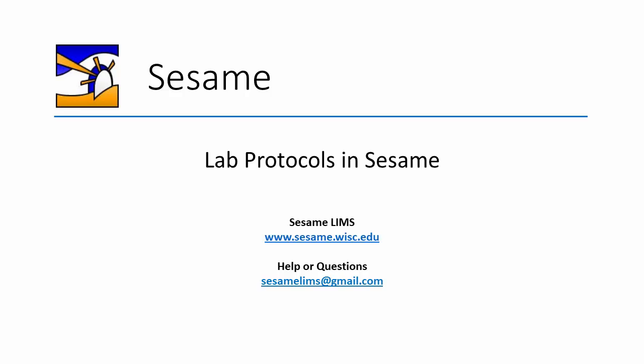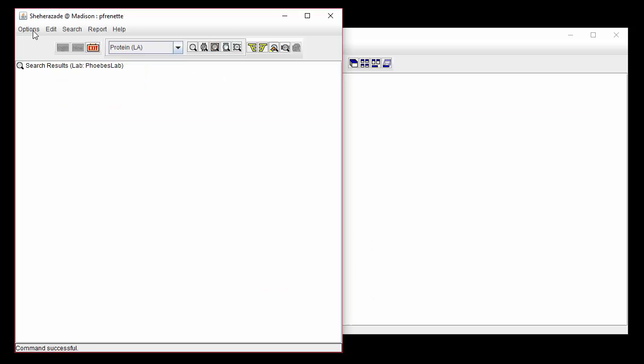Hello and welcome to this video tutorial about using the lab protocol lab resource in Sesame. For this tutorial, we will use the Scheherazade module.